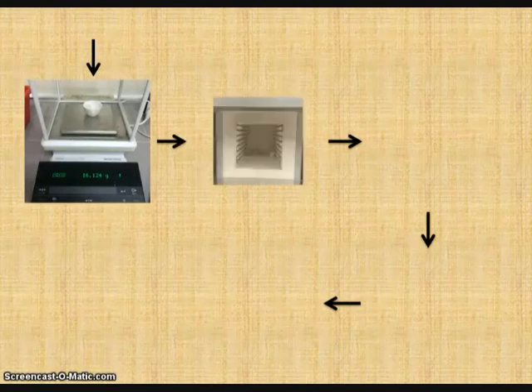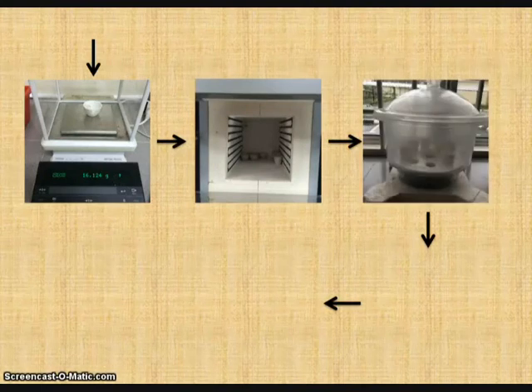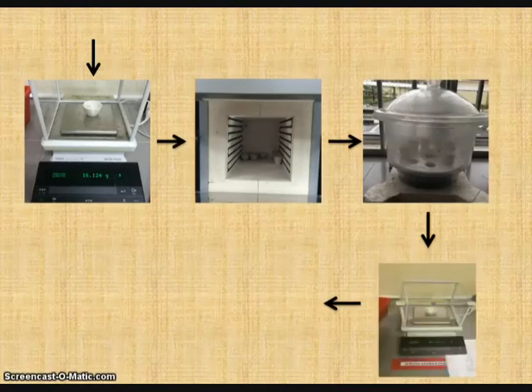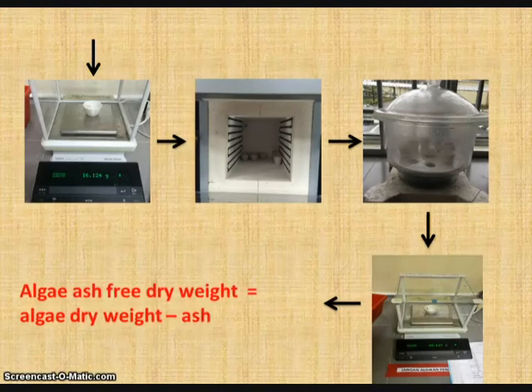Then it is transferred into the furnace at 540 degrees Celsius for 4 hours. After 4 hours, it is transferred into a desiccator to cool down. Then it is weighed again to get the ash weight. By using the formula of algae dry weight minus ash, we obtain the algae ash-free dry weight. In this batch culture exercise, some calculation formulas were used.